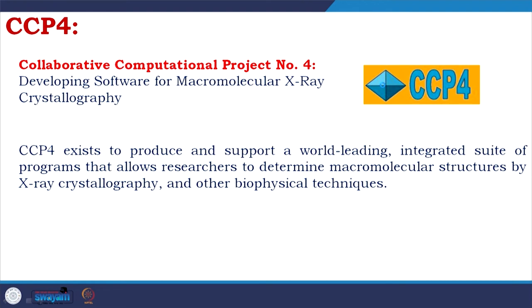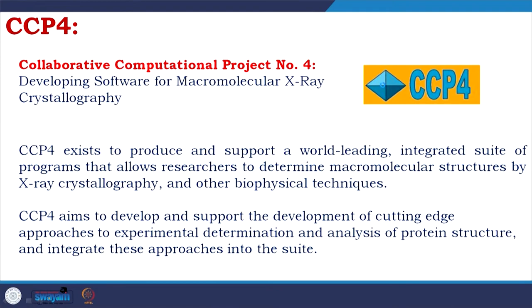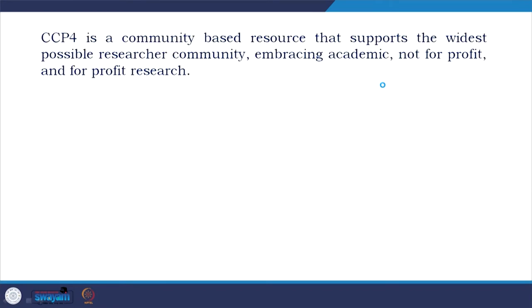They started with X-ray crystallography, but now they definitely help cryo-EM, NMR, and other spectroscopic techniques can also get their analysis using CCP4. CCP4 aims to develop and support the development of cutting edge approaches to experimental determination and analysis of protein structure and integrate these approaches into the suite. CCP4 is a community based resource that supports the widest possible researcher community, embracing academic, not for profit, and for profit research.